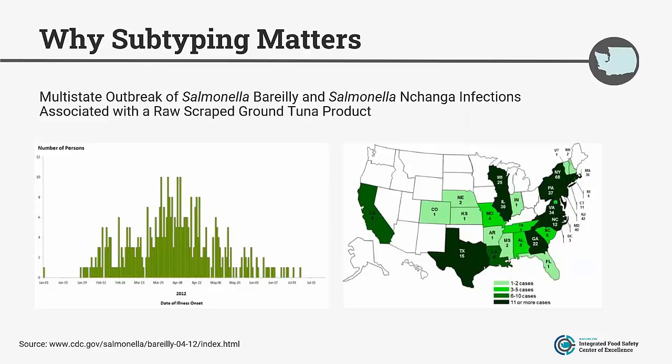So when the patient did confirm that they had consumed spicy tuna rolls, a light bulb just went on with me that how cool is this that we can know by the DNA fingerprint of the bacteria in the urine specimen from this patient that it was highly likely that they had eaten this raw ground tuna. And that was just such an exciting aha moment for me about how this information could be used. So within a few months after that, I had the opportunity to move into a specific foodborne role, and I've been working with PFGE and sequencing data ever since.